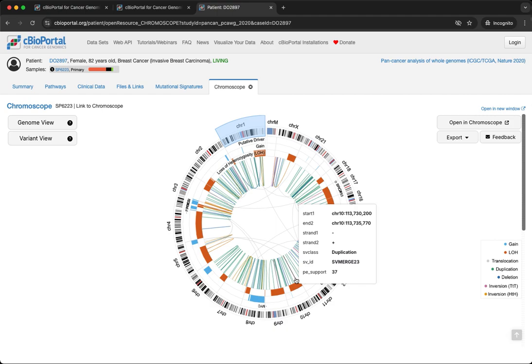And it's a very specific type. Their size tends to be within a few thousand base pairs. These are characteristic of samples with true loss of the BRCA1 gene. Let's now inspect the structural variants in more detail.